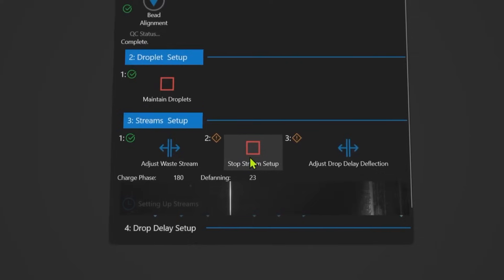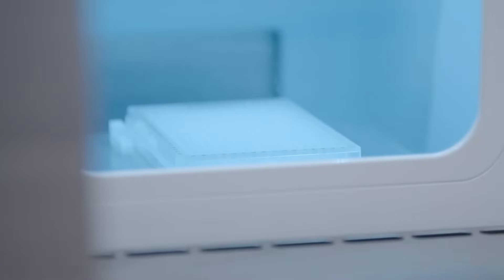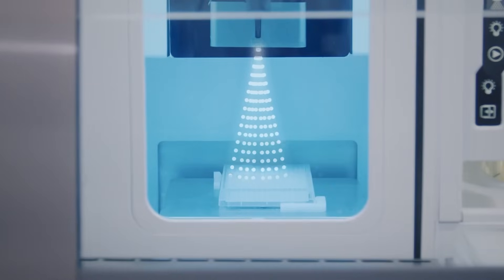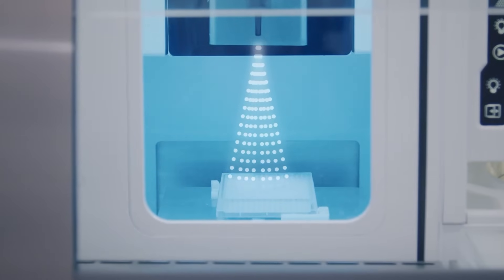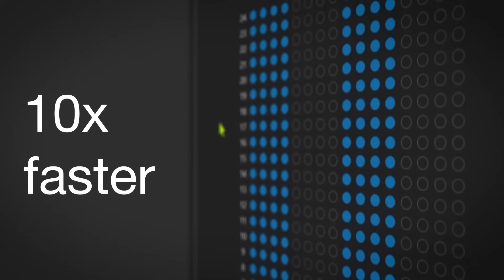Configurable, quick, and calibrated, the high throughput of the multi-way plate sorting of the InvitraGen Bigfoot Spectral Cell Sorter with Sasquatch software helps achieve maximal productivity. It is in a league of its own, up to 10 times faster than the competition.